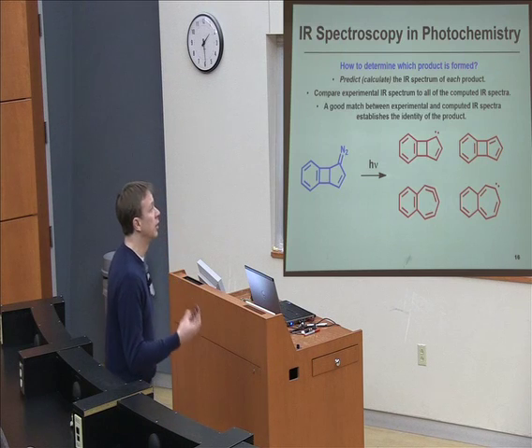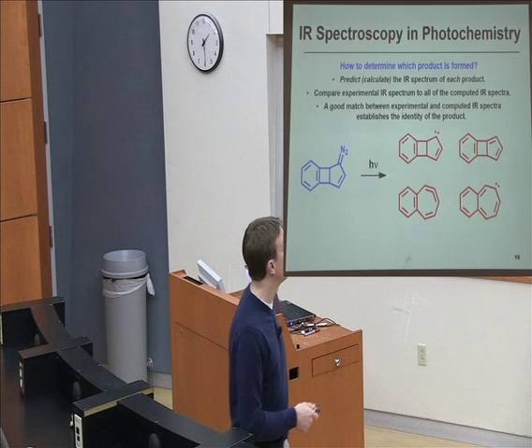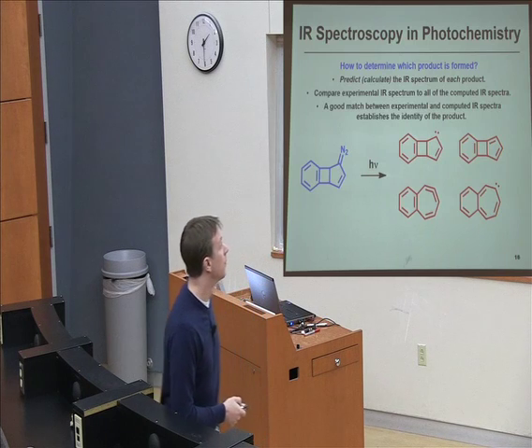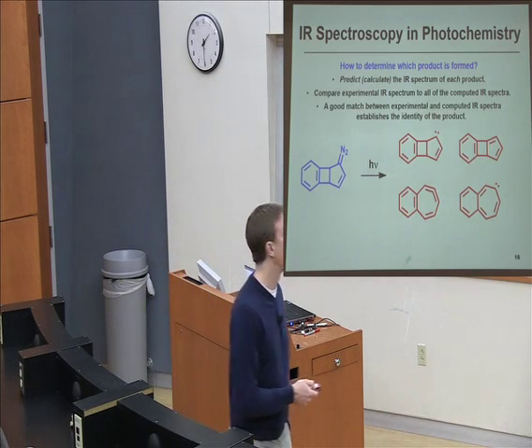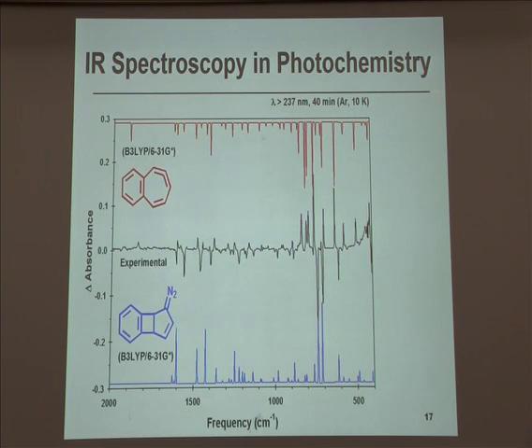These are all pretty strange molecules that are certainly deficient of a lot of hydrogens, which is why this reaction was done at such a cold temperature. IR spectroscopy was actually used to confirm the identity of the product in this case, which is a pretty neat application. So this is a subtraction spectrum and a fairly complicated IR application, but it can be understood pretty simply.